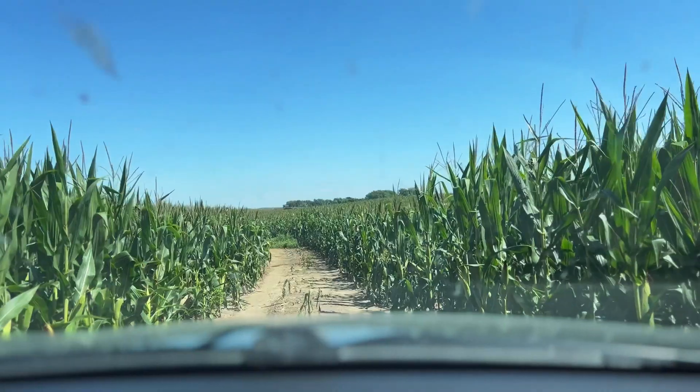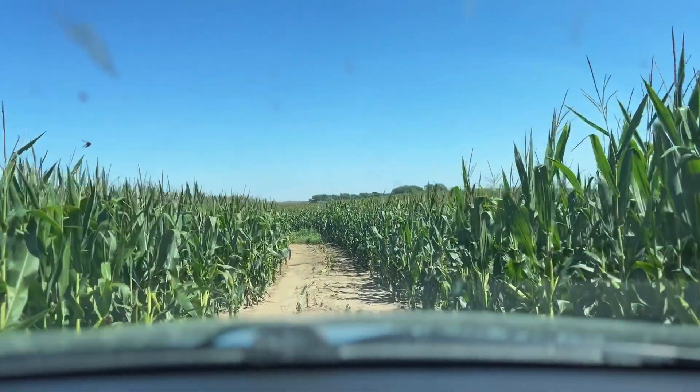Welcome to Midwest Labs. Today we are going to show you the journey of the soil sample.